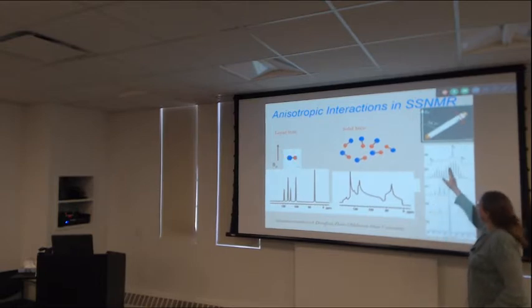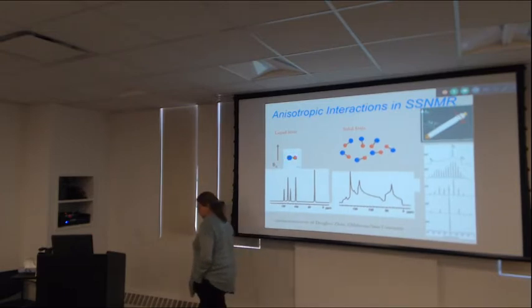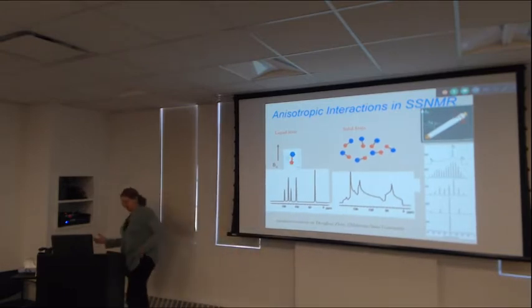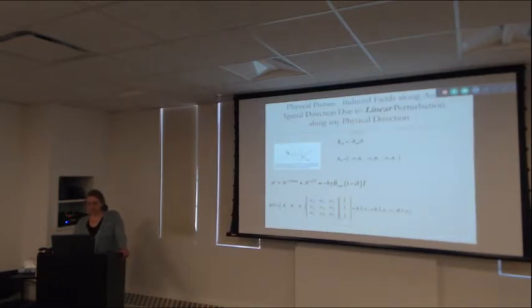But you always know that one of the peaks is at the isotropic shift, and then the spacing is the rotor frequency, so you know where to expect them. But from one site, you get many peaks. Still, it could be very informative. It's a strange result, but it could be very informative. We're going to derive all this kind of stuff.